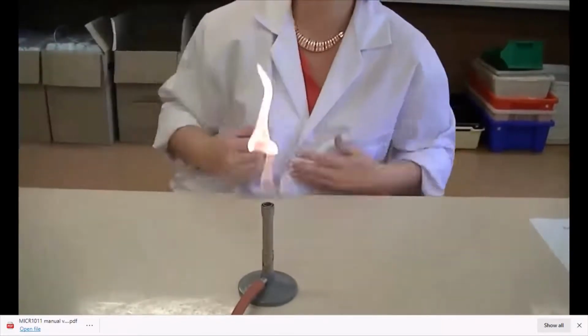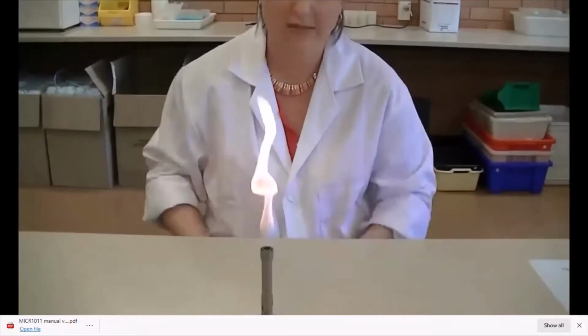When you're not directly using the flame, you should have it on the orange flame, just so that you're aware that it's there and that you don't accidentally wave your hand or arm through it.